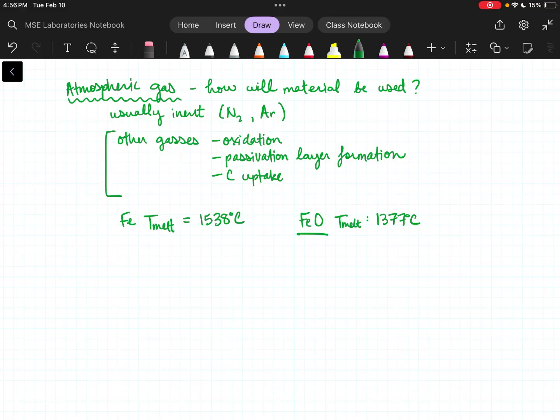And one very last final consideration: supercooling or superheating.